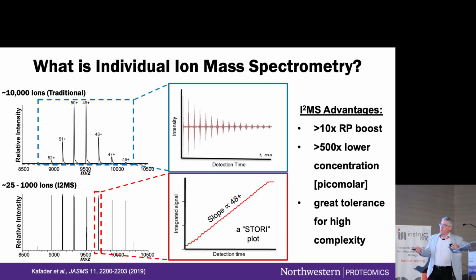When you do that, it was known that in Orbitraps, you could detect a single particle. You could detect a single ion. The sensitivity wasn't the problem. It was defining those pesky charge states. So you can see, actually, what these are. Now, if these are 50 ions, we let 50 ions into the trap, okay? And you can see where there are abundant charge states. You see a few isotopic peaks. Here's a single isotopic peak from that homotetramer, okay?